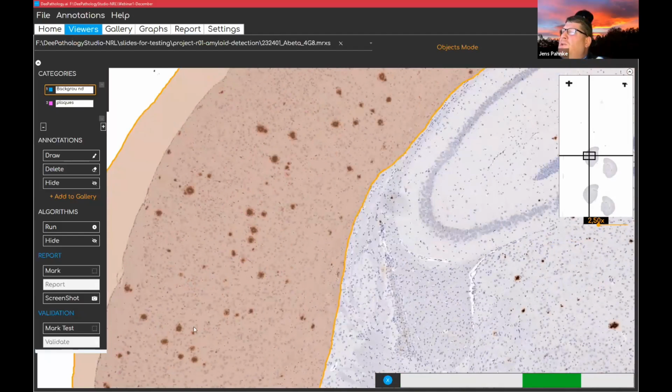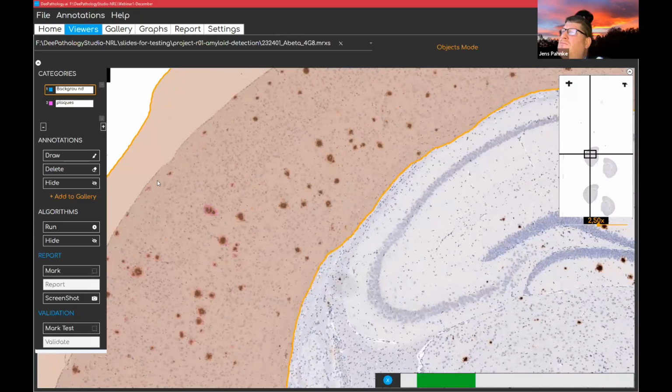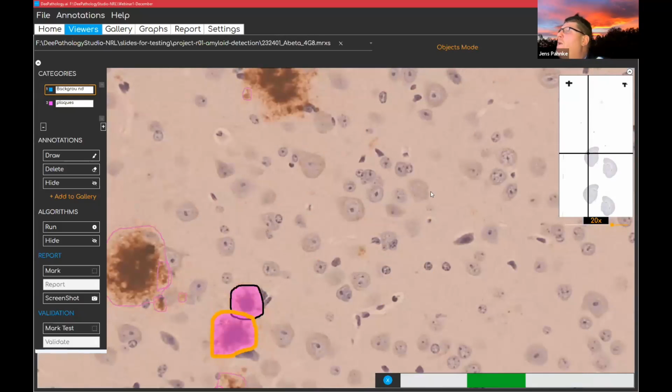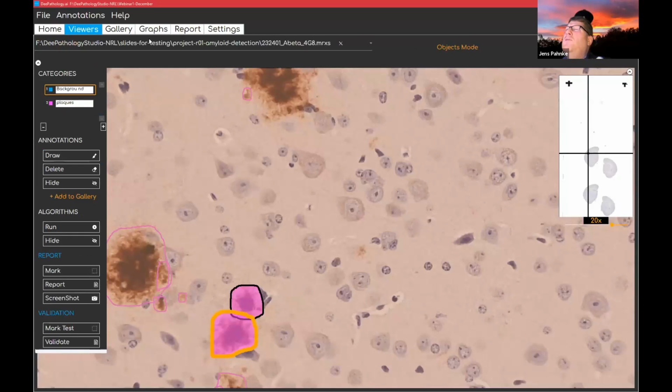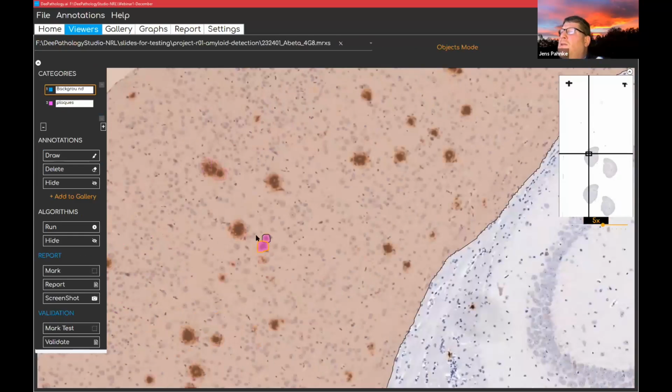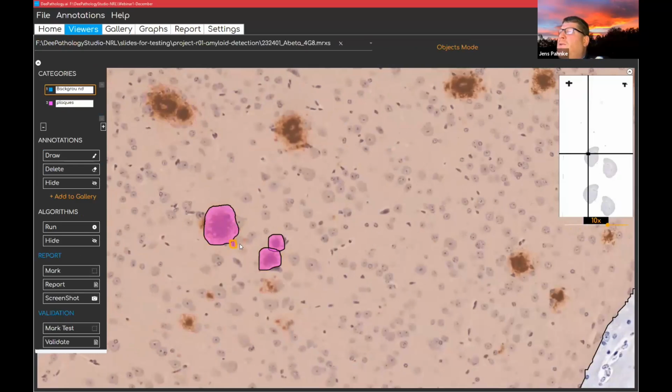So that's what I usually do. Then I check how it works, and I discover some things that I don't like very much, so I can incorporate these in learning. I stop this now here, and then I can go to the settings and run the teaching further. And then I go here and incorporate the right ones for the teaching.